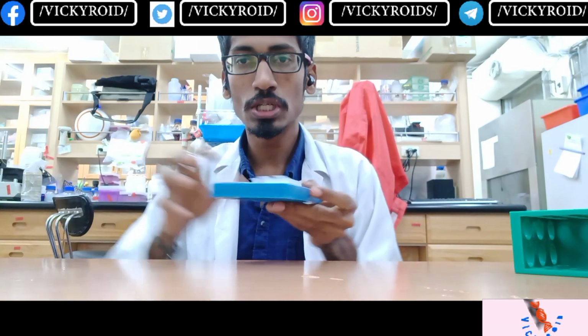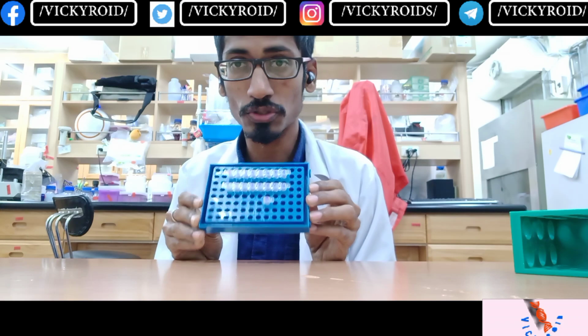I have already isolated the bacterial DNA in the last video. So this is the sample. Those who have already watched the last video can recognize this one. This is the DNA of 17 bacterial isolates. I have isolated DNA from the 17 bacteria, and now I'm going to perform RAPD using the M13 primer.